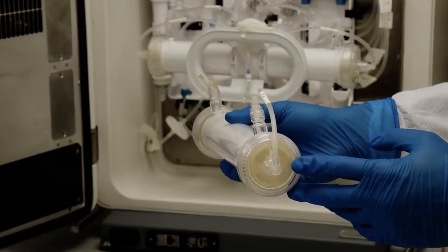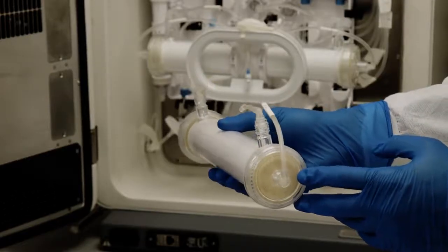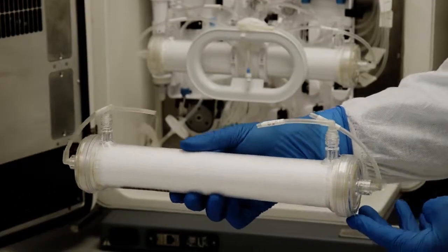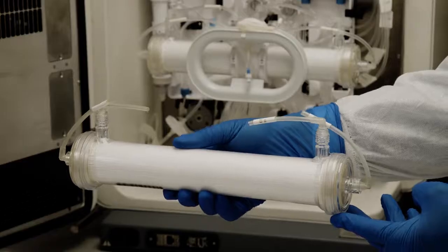For suspension cells, the effective working volume within the bioreactor's 139 mils. But the unique dual loop pathway allows for much higher cell densities. This bioreactor can hold a range, but upwards of 25 billion T cells.